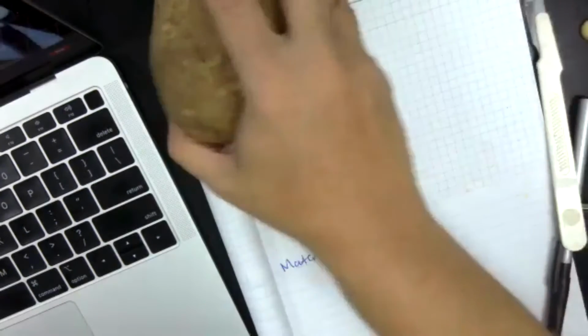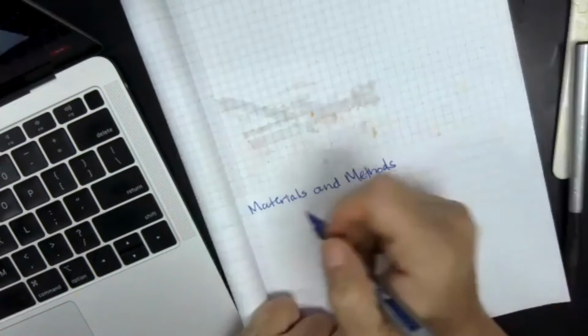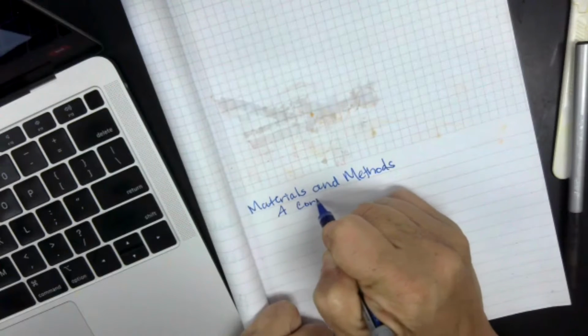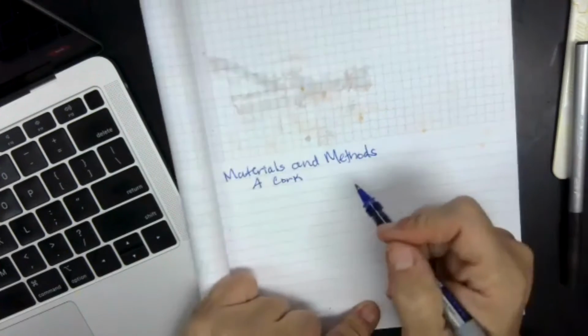So let me go back to the writing process, or what we're going to be doing here. You're going to use a cork borer. Your words don't have to be exactly like mine.